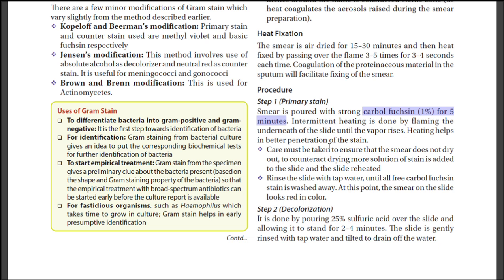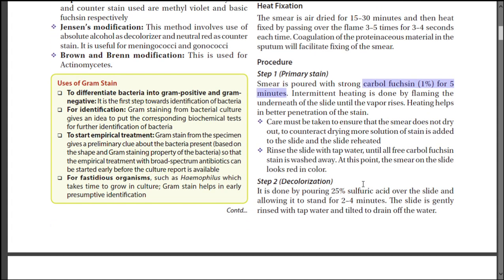Okay, in order to overcome the drying, we need to add more solution of stain and the slide is reheated. Next, we want to rinse the slide with tap water until all carbol fuchsin is washed away. Now the smear looks red in color.